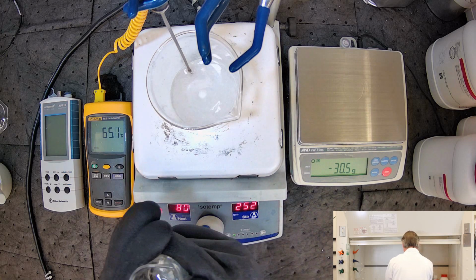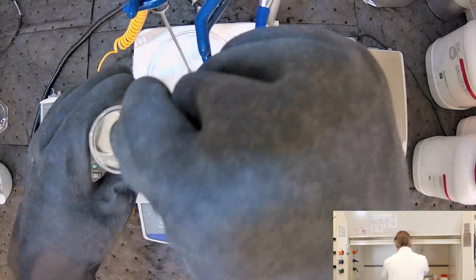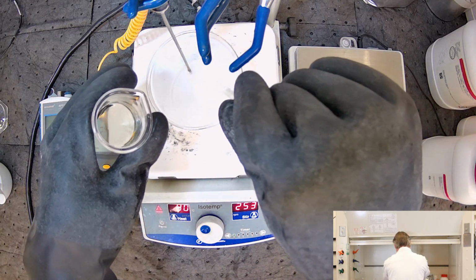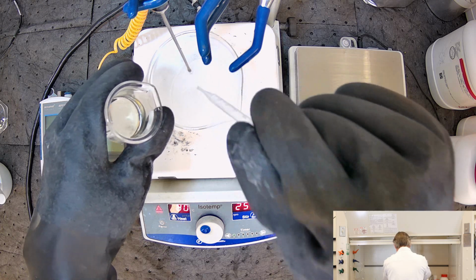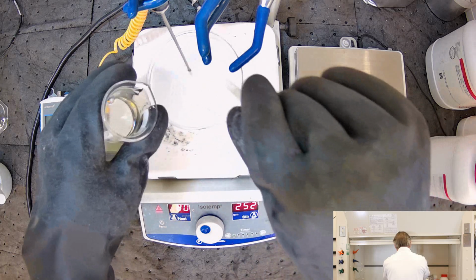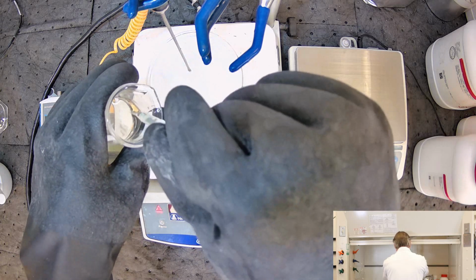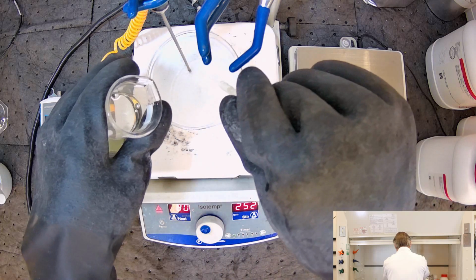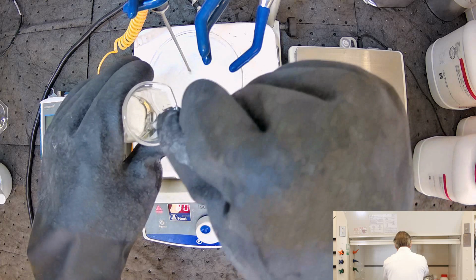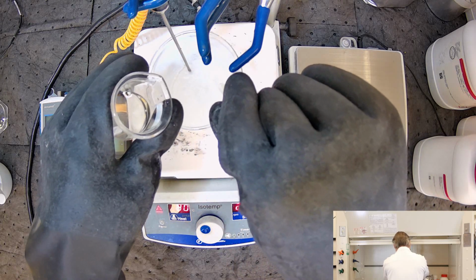So here's our nicotine, and I'm going to use a pipette to put the nicotine in slowly. This is what you should do. You'll notice that's very, very clear. Put this in. But be mindful of anywhere the nicotine could drop or drip is a very toxic place, and then you will want to clean it up very, very carefully. Notice that I'm just dropping it in drip-wise, and this is just in case you run into a situation where the reaction takes off on you and gets very, very hot. You don't want that to occur.